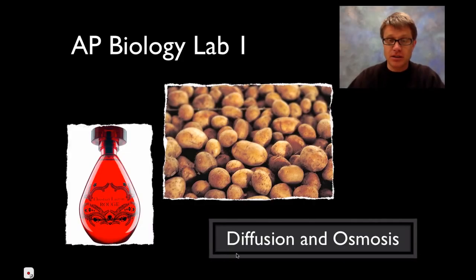This lab is on two things. It's on diffusion and osmosis. In the diffusion portion of this lab, we're actually just going to do a demonstration. In the osmosis lab, we'll do the potato lab. So we're going to put potatoes in different concentrations of sugar water.